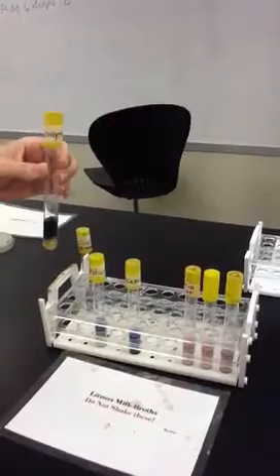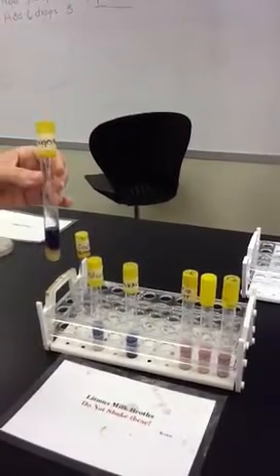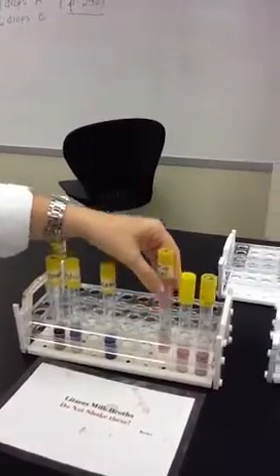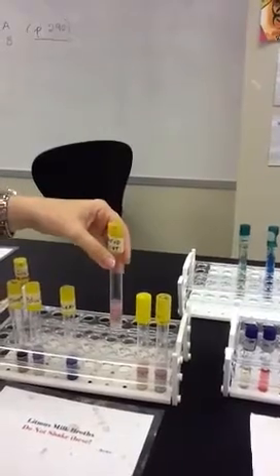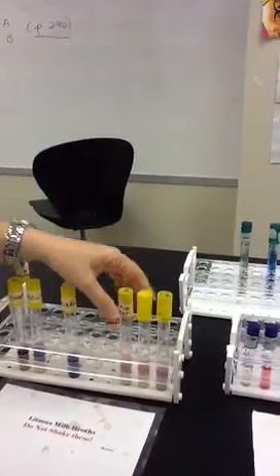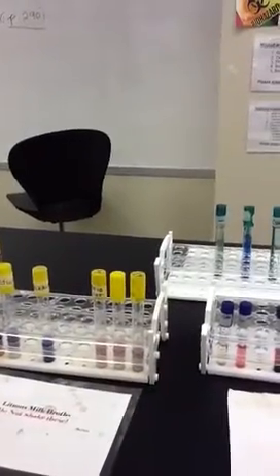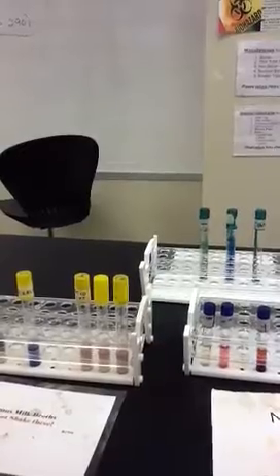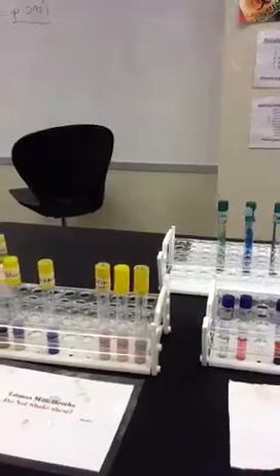This should be... Well, if it was completely like this, or the tea color, it is complete digestion. Okay. And that's like a dark purple. And the pink is the acid. And we don't need an acid plot. We need it all pink for acid, blue for alkaline, and tea color for complete digestion. Tea colored? Yeah, like a brownish, like tea. Almost like brownish black. We don't really have one. It's like that, but a little more brown. That's just because it's old, right? Yeah, that one's old. Otherwise, they look like tea.